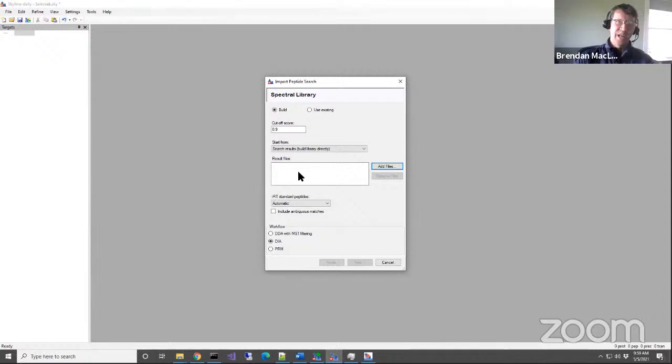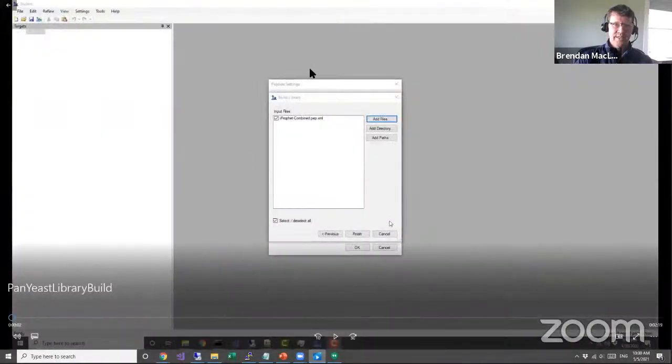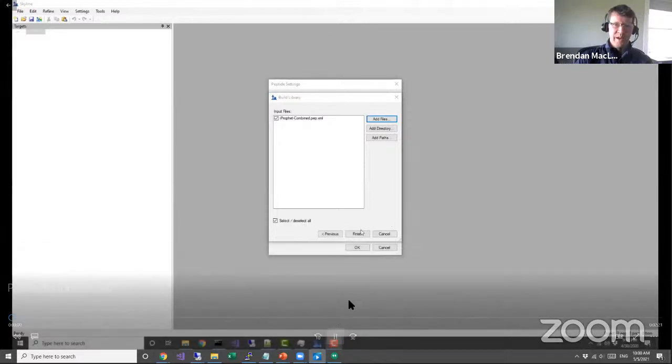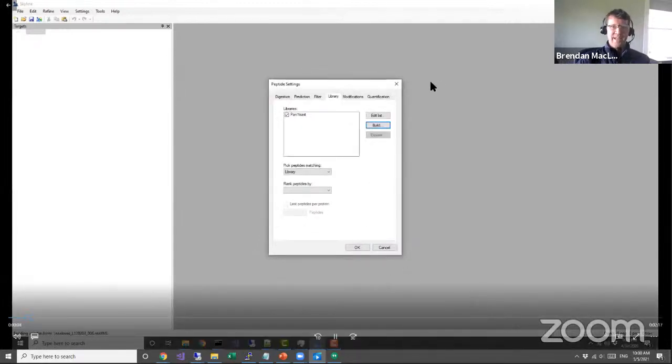This is, again, gigabytes worth of data, and I chose not to have you download all that. And then it takes 27 minutes to do the build. So it's a pretty long build because it's a highly fractionated data set. So instead, I'm going to have a video here. This is me doing it last year. I recorded it, and I'll just play that, and you can see what would happen next from this video.